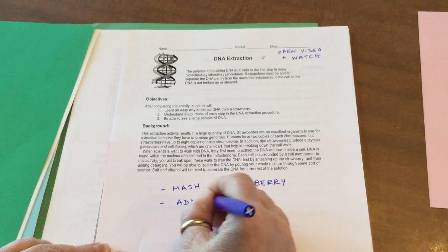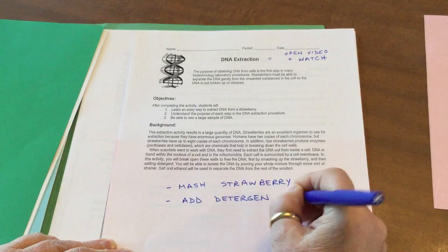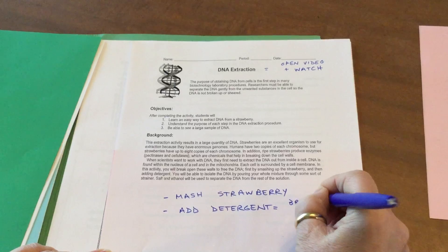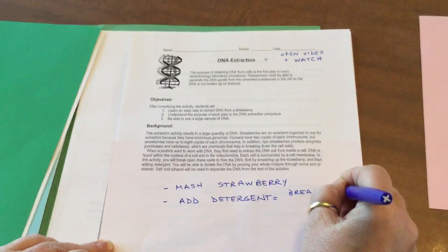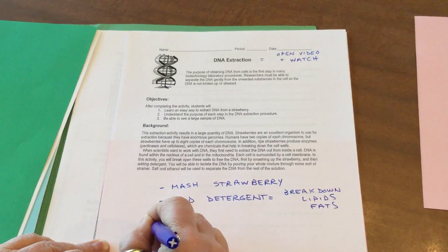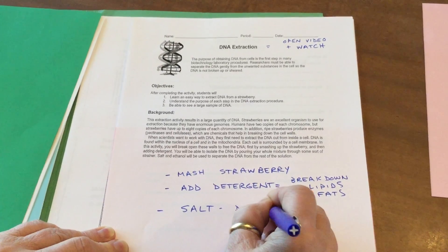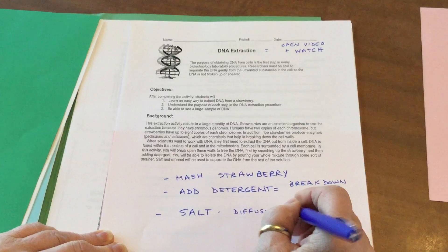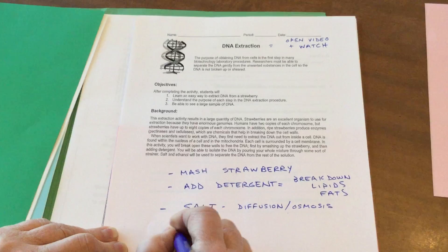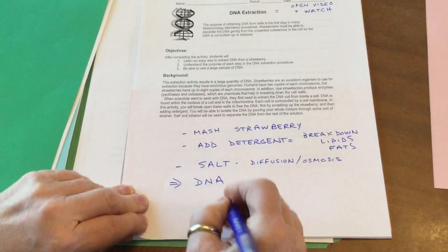Then they will be adding things like detergent, which is going to break down lipids — the fats. They're also going to add stuff like salt, which we know about from diffusion and osmosis — making cells swell or shrink and burst — so that we will be able to get out the DNA.